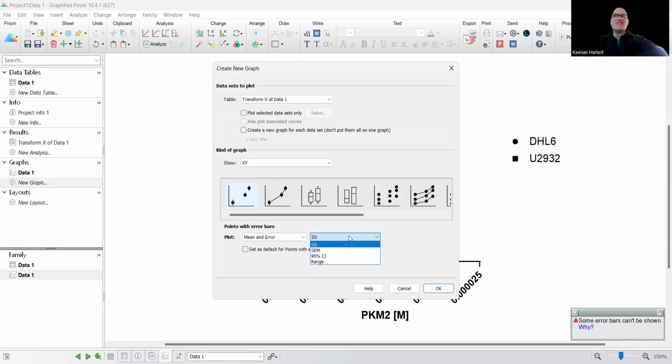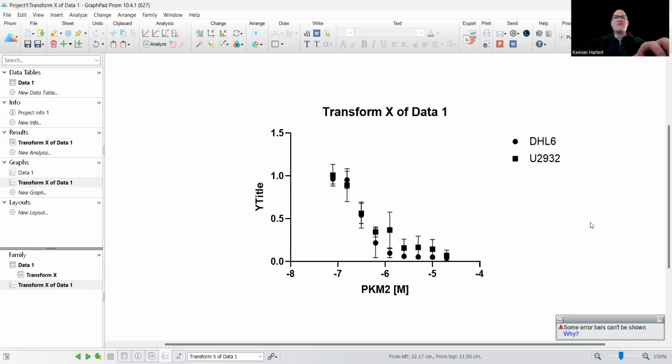Standard deviation is tougher when I only have 6, for example. You can do SEM at these lower population levels, again, or 95% confidence interval, or if you want to have a bigger setup, you can do just full on range. For just keeping things a little normal, let's just keep it at standard dev right here. It's not technically going to change much other than how it looks in this case for us.